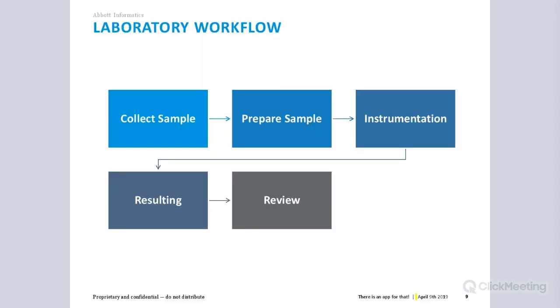So with all the fun compliance details out of the way, let's delve a little bit deeper into LIMS mobile applications. I'd like to start just by looking at a simplified standard lab workflow you can see on the screen now. Now, your workflow in your laboratory might be much more complex, but that's actually good news because mobile applications help you optimize your processes. So the more complex, the more ability to optimize.